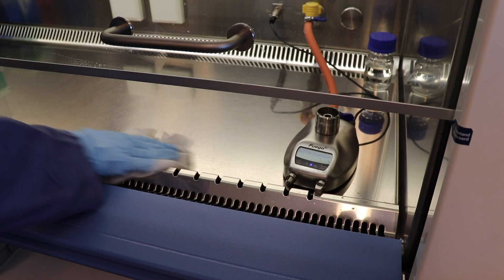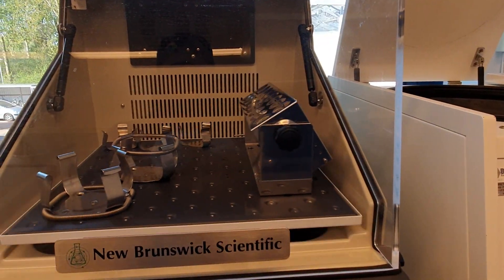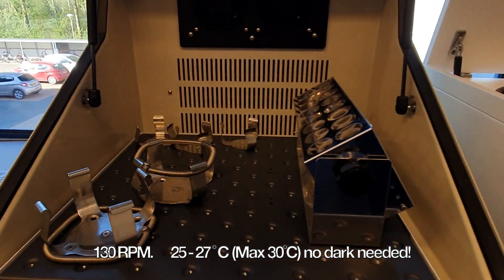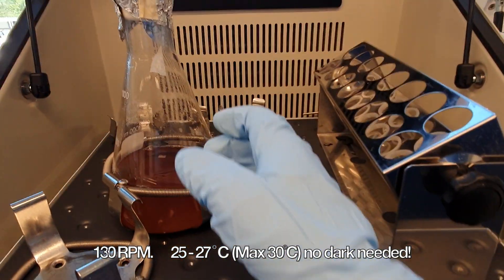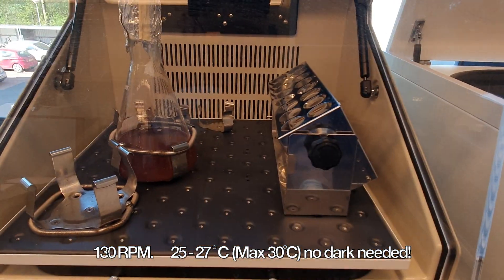We clean the bottles very well and bring them to the shaker. The speed can be 120 to 130 rpm depending on the machine, and the temperature between 25 to 27 degrees Celsius — it can also go up to a maximum of 30 degrees.